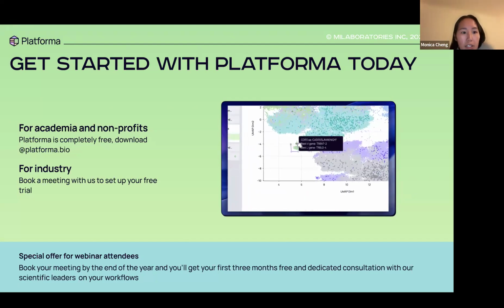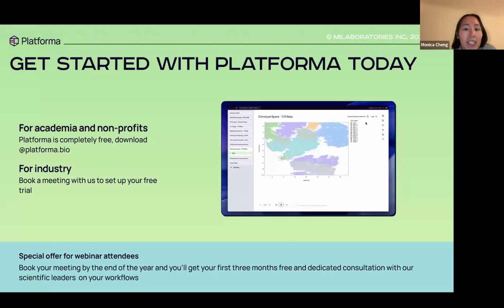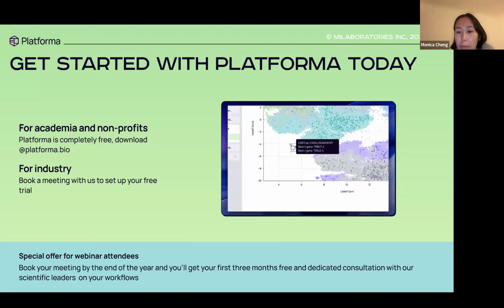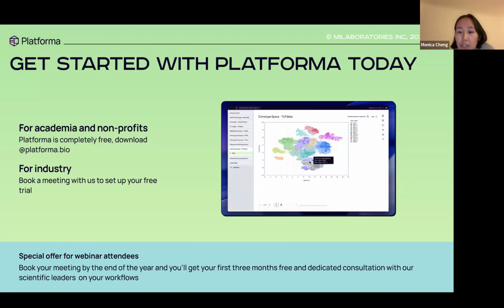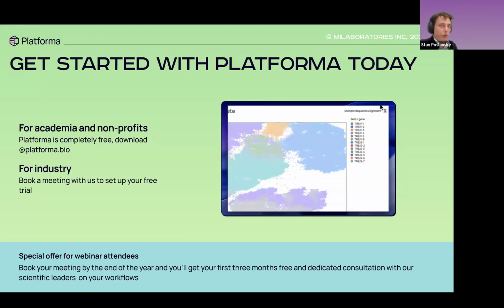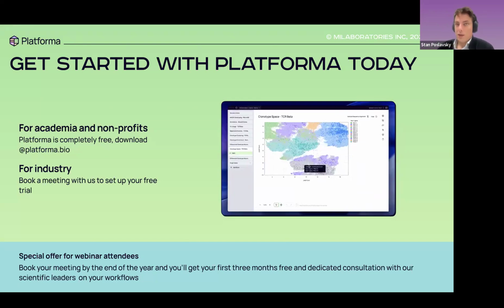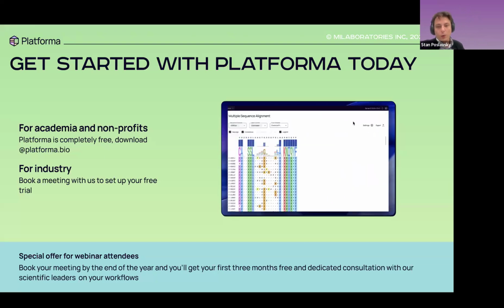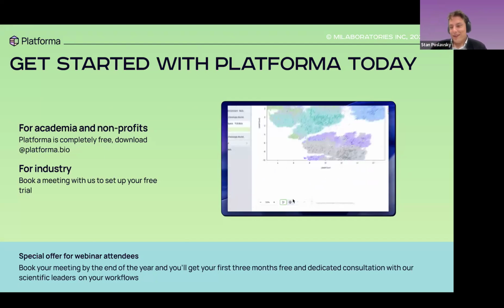And let's see. It looks like we are tied for generative AI and also for 3D structure integration. And also, just looking at it now, for complex formats, so specialized analysis for bispecifics, CAR-T, or non-standard scaffolds. So pretty split across the board here. Yeah, the good thing is that we already have specialized analysis for all these other types of non-standard scaffolds that's already available, and the 3D structures is what we already have in the beta version. And AI, yeah, it's a trending thing.